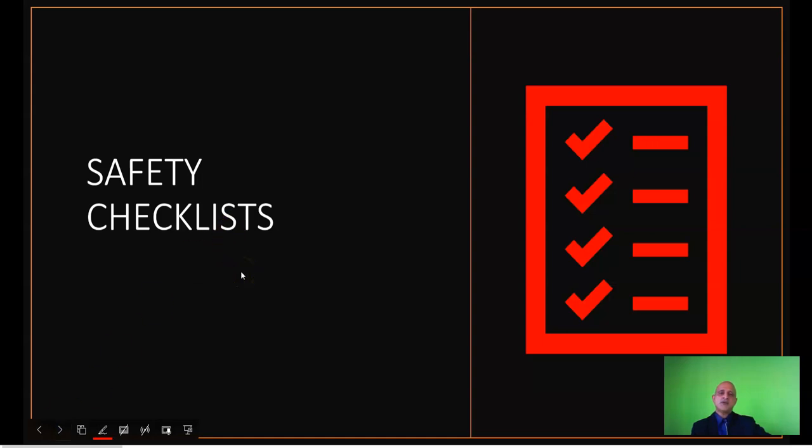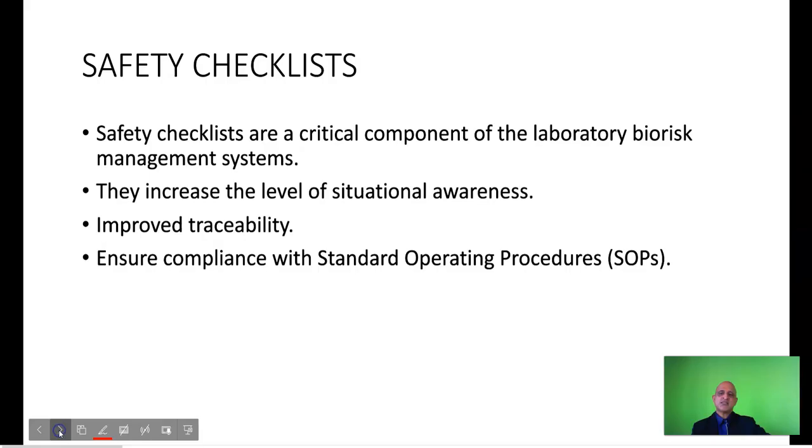The WHO Laboratory Biosafety Manual gives us a large number of guidelines on the development of checklists. Now, checklists are basically associated with standard operating procedures. You may be aware of the checklists in an aeroplane, for instance, where the pilot undergoes a specific set of procedures, and then he or she will complete a checklist. This checklist will ensure that a procedure has been carried out, and they improve what is known as situational awareness.